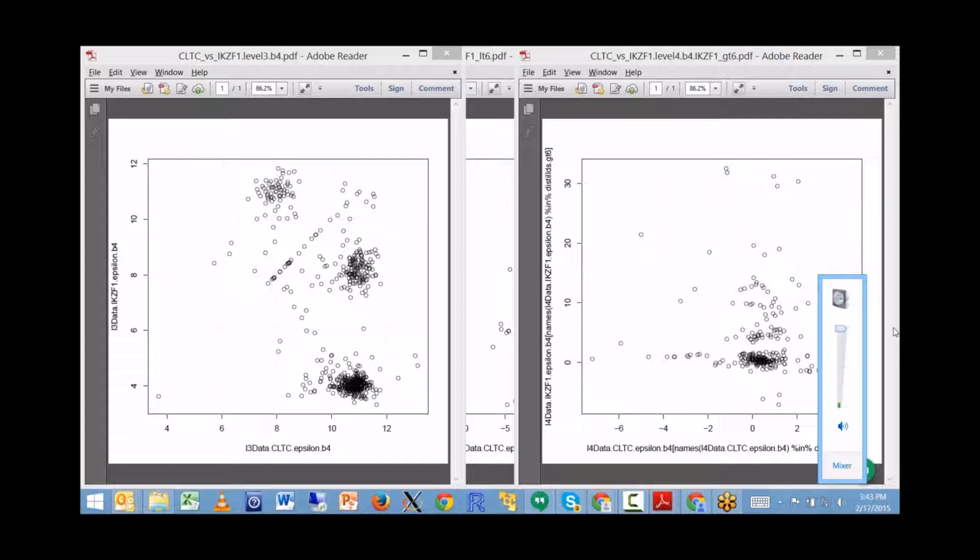So Chad, do you have any idea of how to systematically do some of these examinations? One thing I've looked at is doing a model-based clustering on the gene pairs, and then looking at how many clusters there are and how many of the data points show up in the dominant cluster, or the dominant group of clusters that may overlap really well.